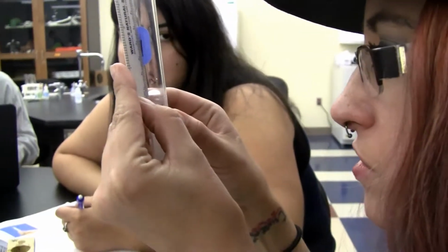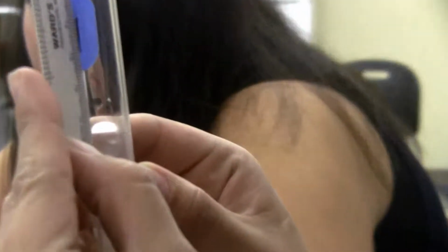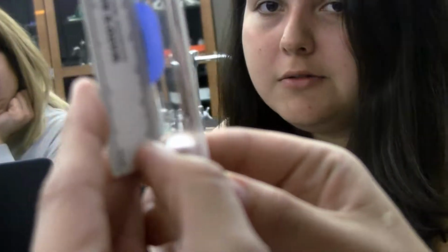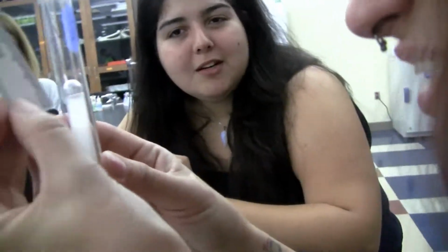So 1, 2, 3, 4. That's like 7. 7 millimeters. 1, 2, 3, 4, 5, 6. In between 6 and 7, and that's to the top of the small glass inside. We'll just round up. Cool. Okay, so now we'll do the fructose. Does it have any gunk? Oh, it does have some gunk in there.